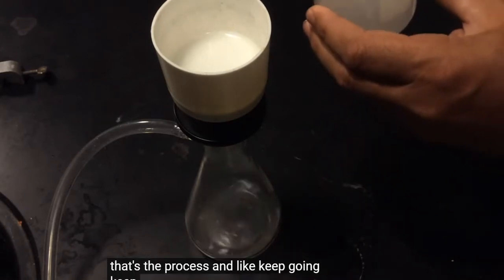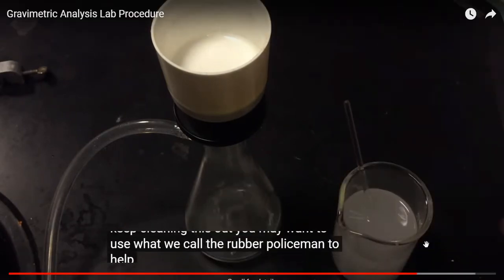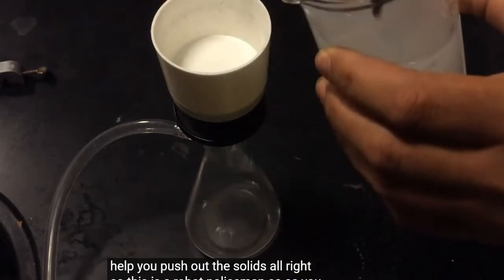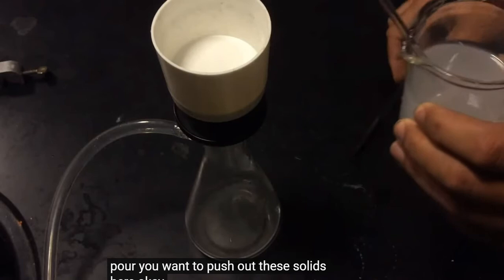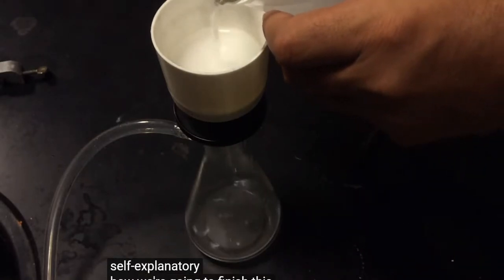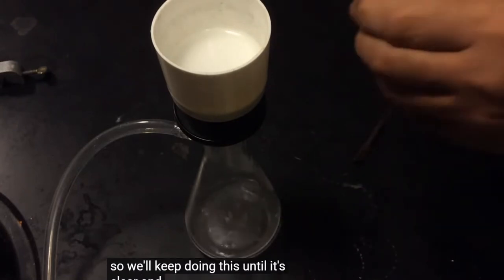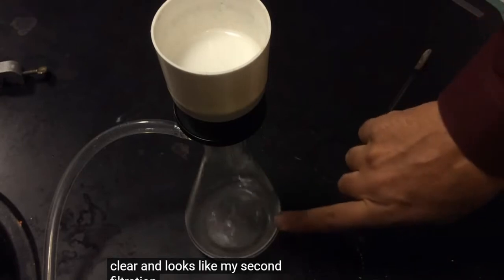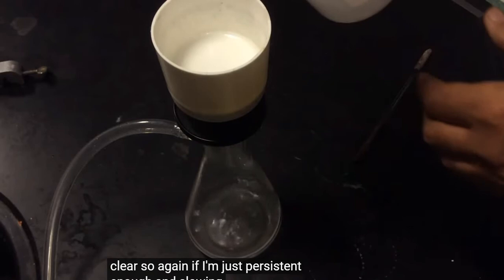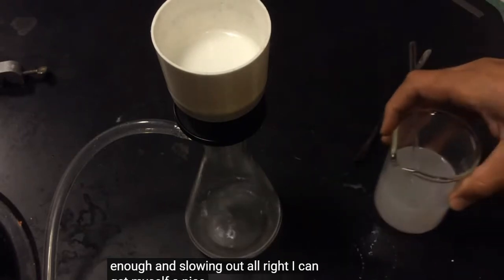You may want to use a rubber policeman to help you push out the solids. All right, so this is the rubber policeman. As you pour, you want to push out the solids here. And again, it's pretty self-explanatory how we're going to finish this. We'll keep doing this until it's clear, and it looks like my second filtration is coming out nice and clear. So again, if I'm persistent enough and slow enough, I can get myself a nice precipitate collection.